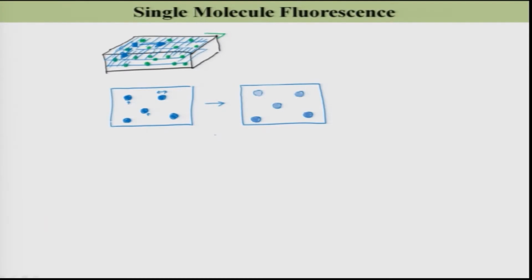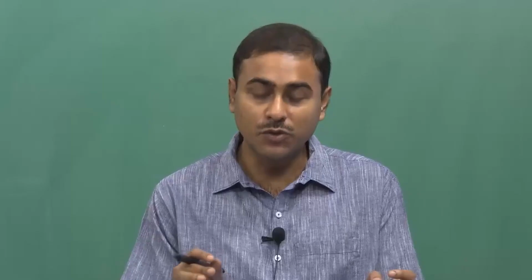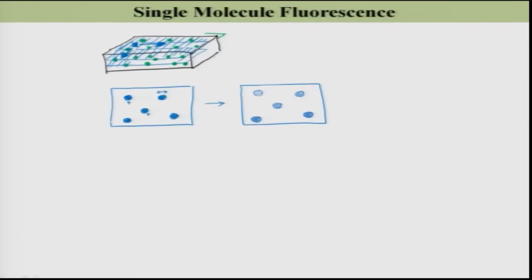As I have taken a sufficiently dilute concentration, it is unlikely that in one place 2 molecules will be there and in another place none, given an even distribution of molecules in this particular medium, considering that there is no specific interaction and all locations in this matrix are equally probable for this type of molecule. The reason behind such a difference in the fluorescence intensity from each spot may be the different orientation of the molecule.